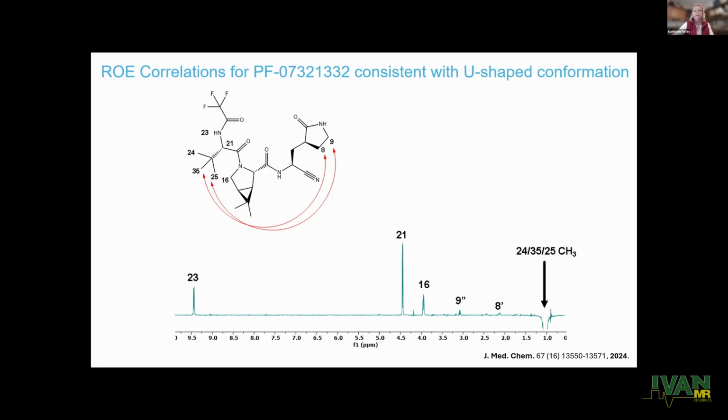And the crazy thing was, with a lot of our NMR techniques that I'm going to describe today, we were able to get this data before there was activity testing. So we were faster than the folks doing the activity testing. So we were able to give the team feedback when they were going into a new idea and they were really changing the molecule up. Did it retain its activity? Did it retain that key U-shape conformation? And feed that back before they wasted their time making a lot of compounds.